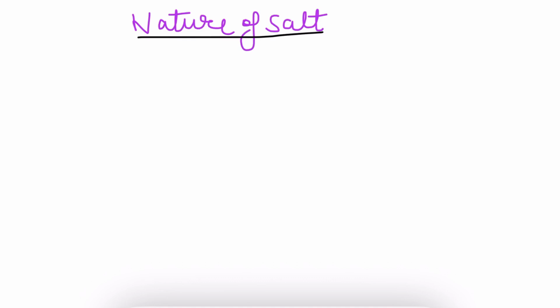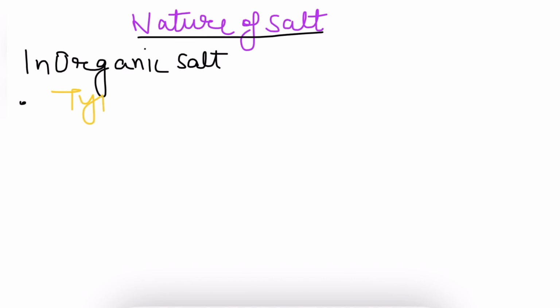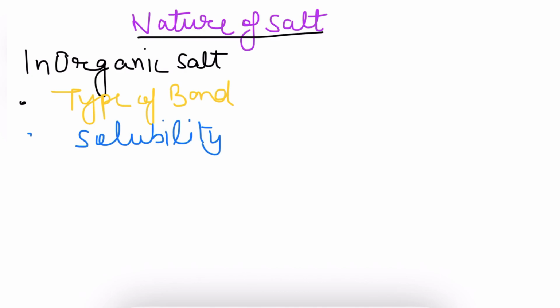Let's discuss the nature of salt. The salt we are having here is an inorganic salt. It has an electrostatic type of bond. We are taking water soluble salts.